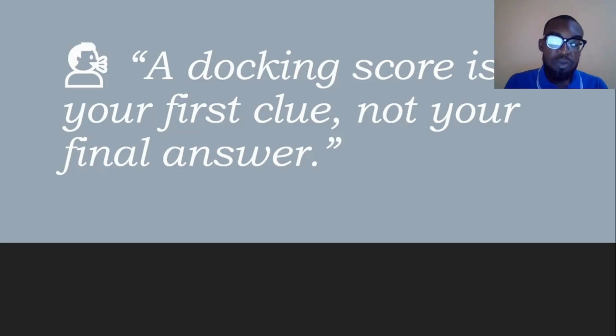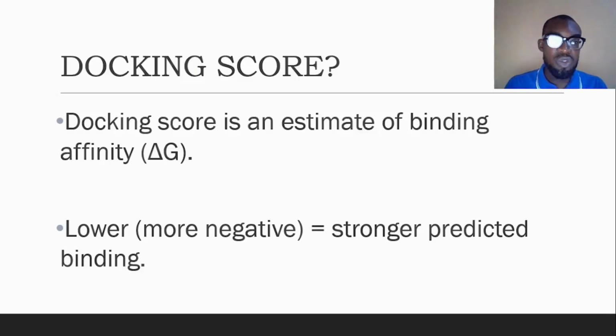For a lot of people, once they've carried out molecular docking and they obtain values, maybe -5, -6 kilocalories per mole, they simply feel they've done everything. But that's not true. A docking score just gives you an inkling into what you're supposed to analyze. The first thing we need to do is to understand what a docking score is.